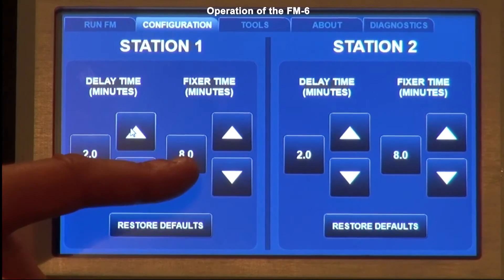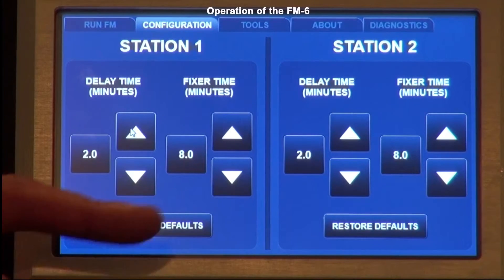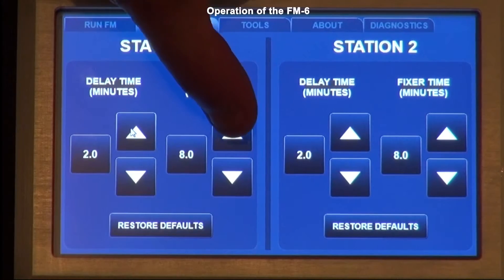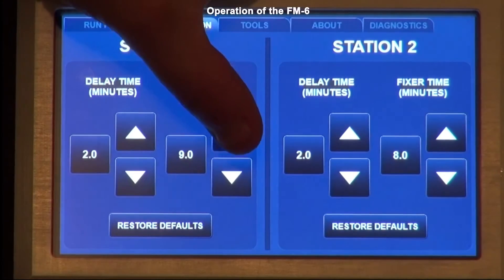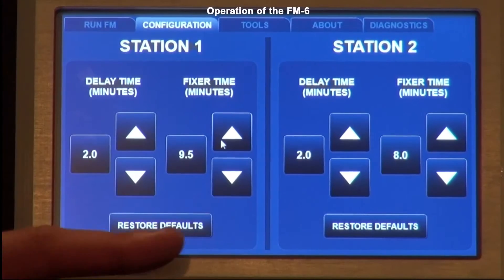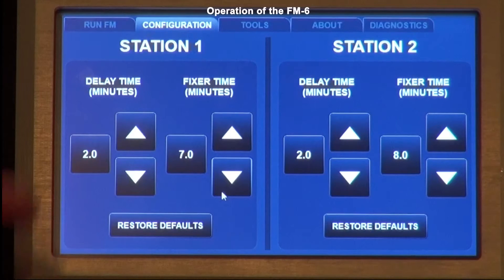The fixer time is simply how long the fixer runs once the fixer light comes on — normally set at eight minutes. If the slide is still wet with oily film at the end of the cycle, increase the fixer run time in half-minute intervals until you find a setting you like. Likewise, if you believe it takes less time to wash the oil off, you can reduce it. Note that this does not change how fast the fixer comes out — that rate is not adjustable.